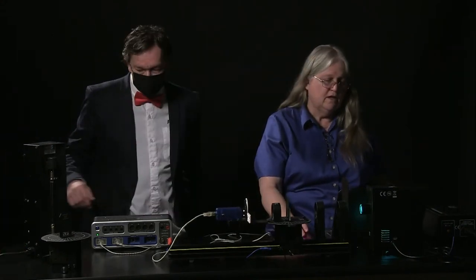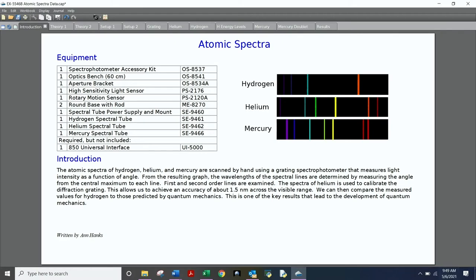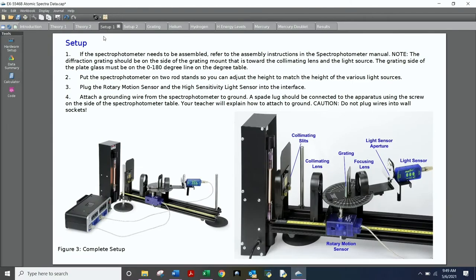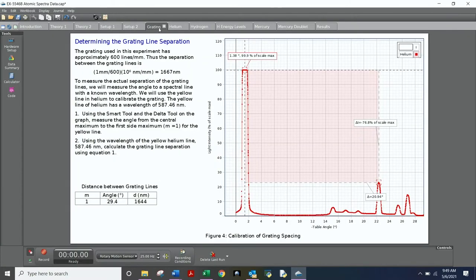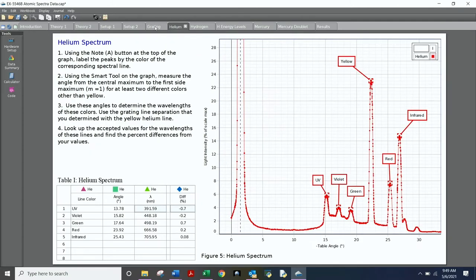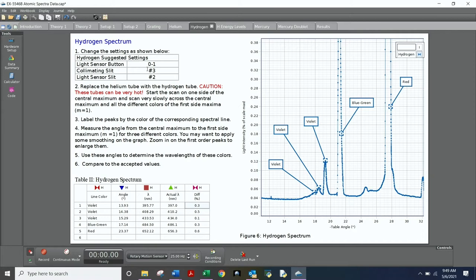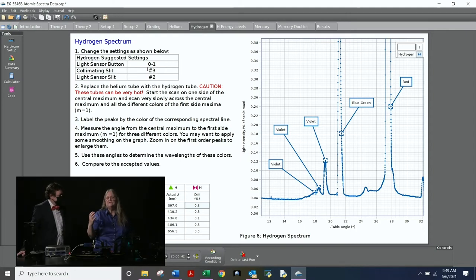There's a workbook that steps you through the theory and setup. One thing that's especially useful is that it has suggested settings. For instance, for the hydrogen setting, it recommends putting the light sensor on 01, which is the most sensitive, the collimating slit on three, and the light sensor slit on two. It gives you a starting point to get the best scan.